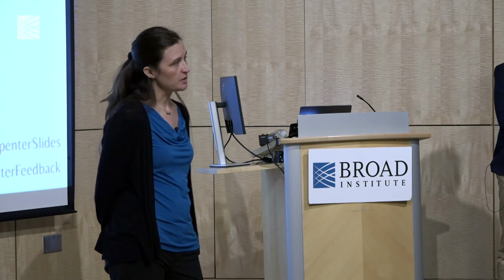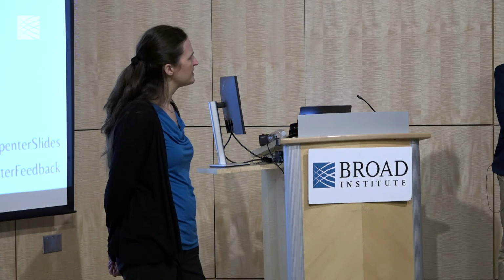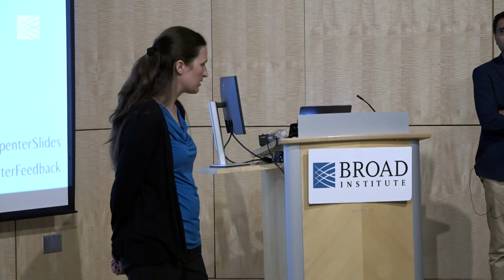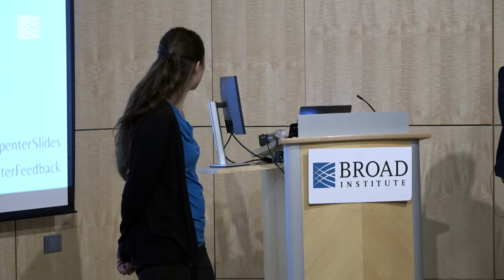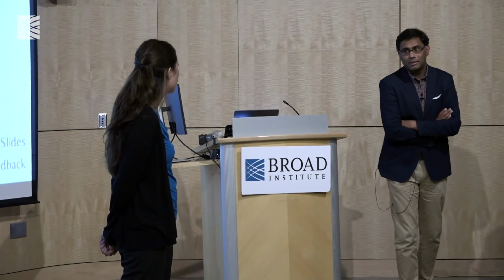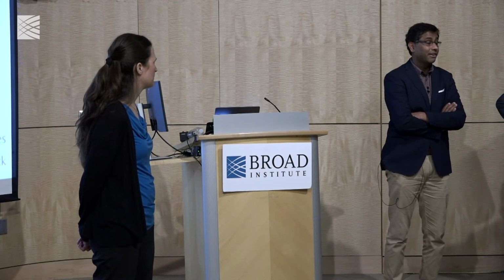Now, with the JUMP consortium data, we have 116,000 compounds, and I don't think we have any statistics yet on how those fall out. Definitely some subset are commercially available libraries, and a good chunk of them are not. I don't know if we know anything more about where they fall in terms of structural diversity. I don't have that yet, but I believe we'll have a lot of those statistics in our data release preprint.